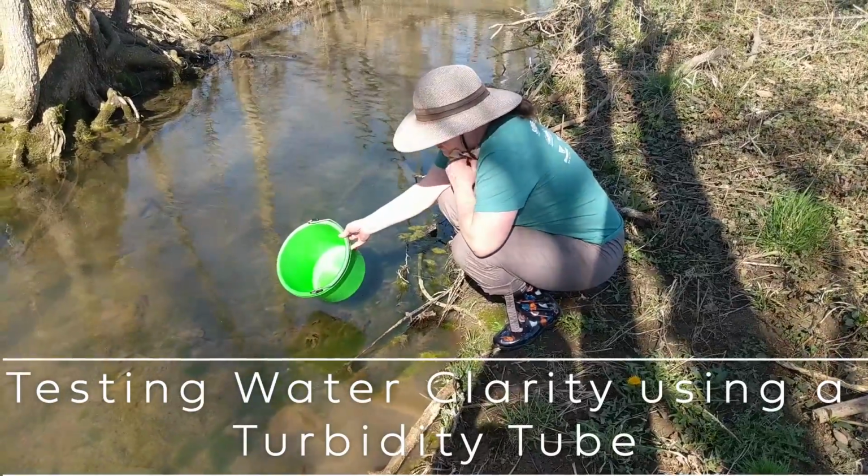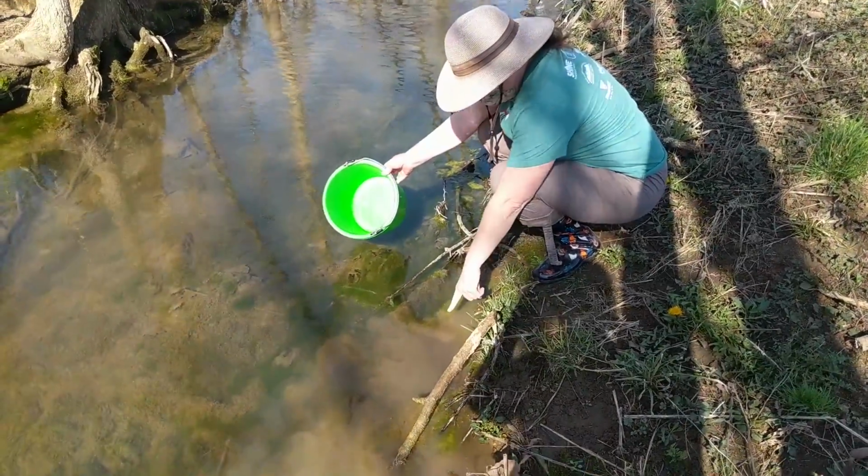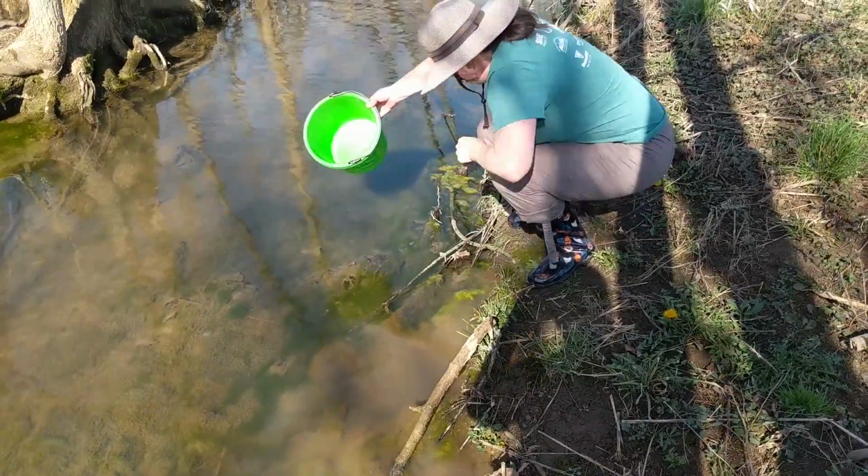Emily is getting water out of Roseville Run. You can see from earlier attempts that we kicked up some sediment and it's a little bit cloudy, so we're going to scoop the water from upstream where the water is clearer.